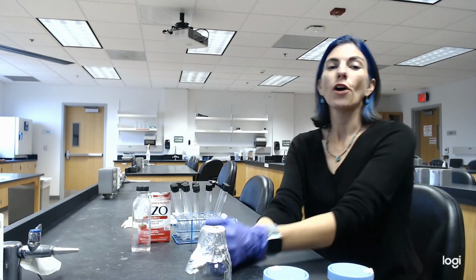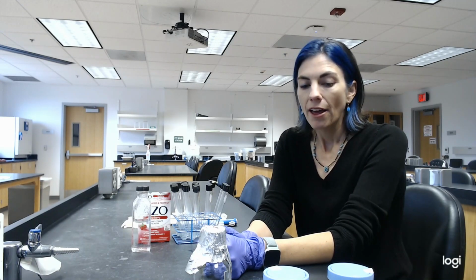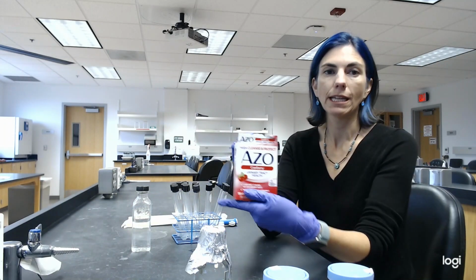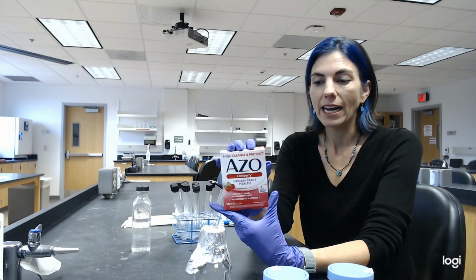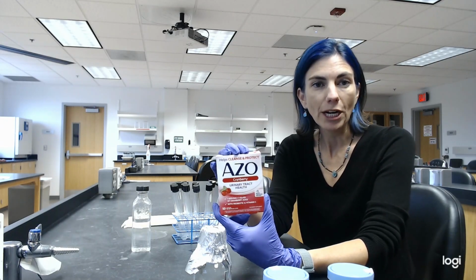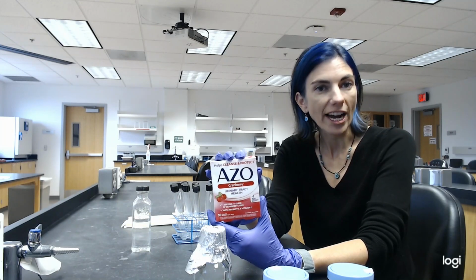Hi, so I'm going to walk you through the premise of one of these experimental designs. This particular one is looking at the effect of cranberry supplements, so I have some Azo cranberry supplements, on urine in regards to its activity against E. coli. E. coli is a major cause of urinary tract infections.